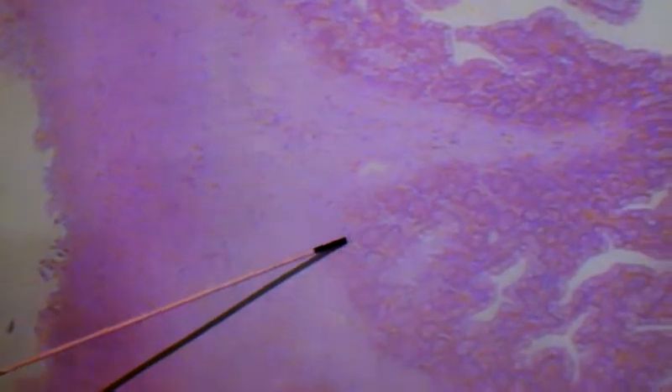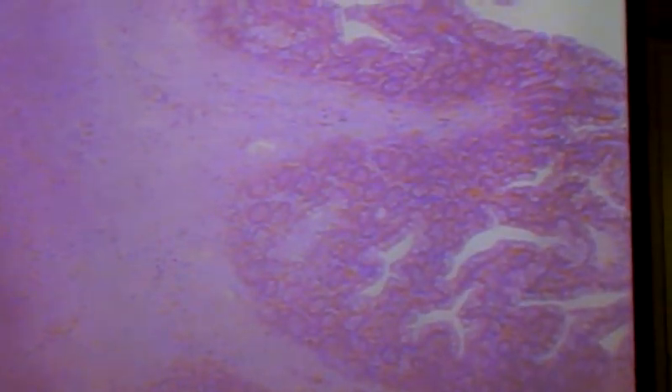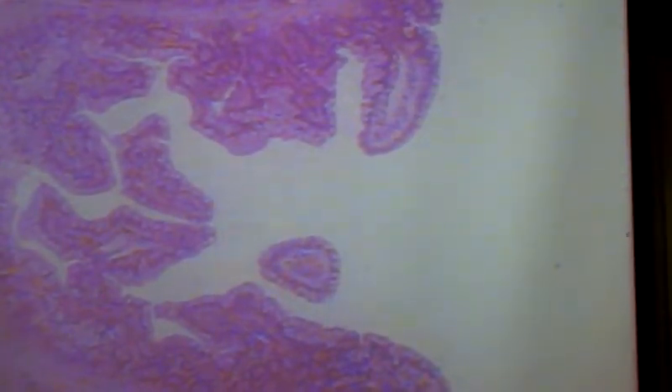So there's our four basic layers. If we come back out to the mucosal layer, in addition to the very large plicae circulares, which throw the entire mucosa into these big folds, we'll have smaller structures called villi. What appears to be debris hanging out there are little finger-like projections. They extend off of the mucosa towards the lumen.